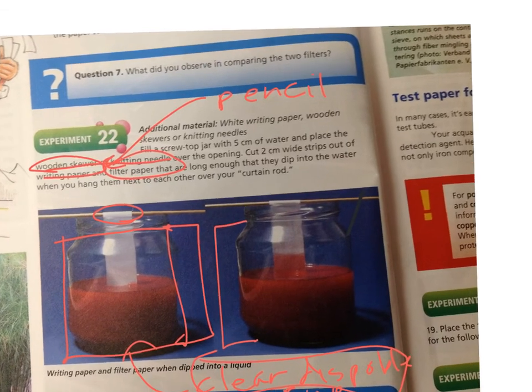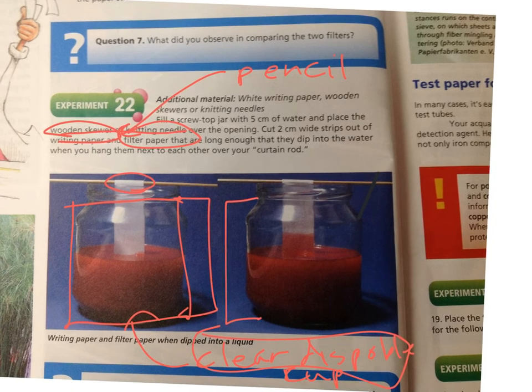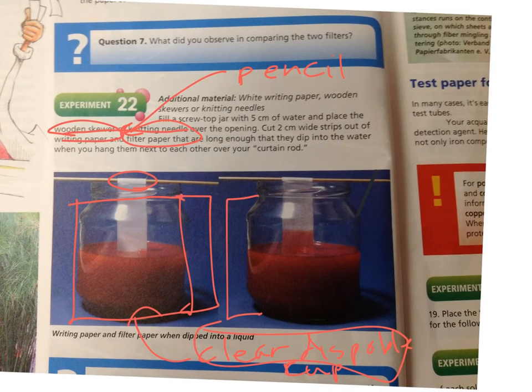Be careful. You are working with hazardous substances again. As always, wear your chemical goggles. Make sure that you read all the boxes on the page, because some of your pre-lab questions will be coming from those little what's happening here boxes.